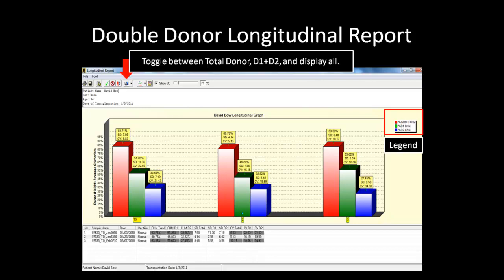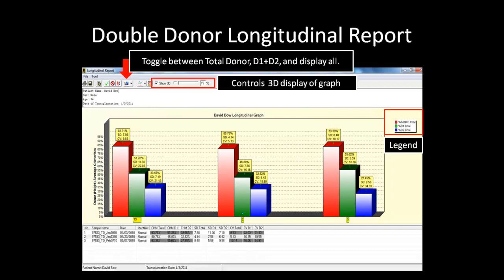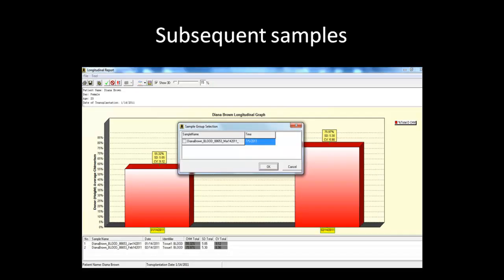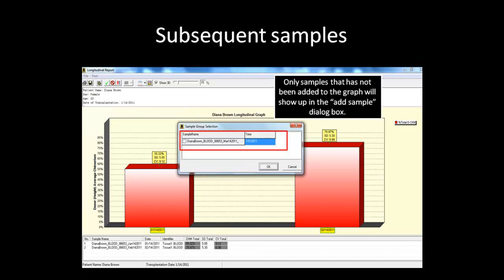The icon indicated in the illustration is used to switch between total donor display and individual donor components in the graph. The Show 3D and 3D bar controls determine whether the graph is displayed in 3D and the extent of the 3D effect. As with the single donor longitudinal report, there is also an information table listing all samples currently in the graph. The table is linked to the graph, so selecting a sample in the table will indicate it with a green arrow in the graph.